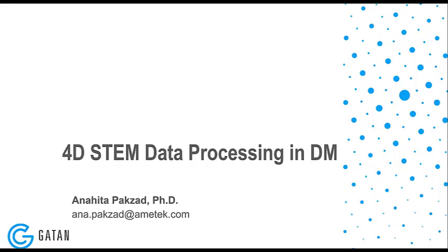In this part of the workshop, we are going to look a little bit at how we can process the 4D STEM data sets that we collect in Digital Micrograph. Before I go into the software, I have a couple of slides just to make sure that everyone is on the same page and we have all the background that is needed before we go and process the data.